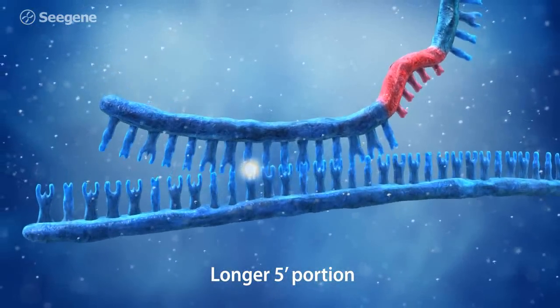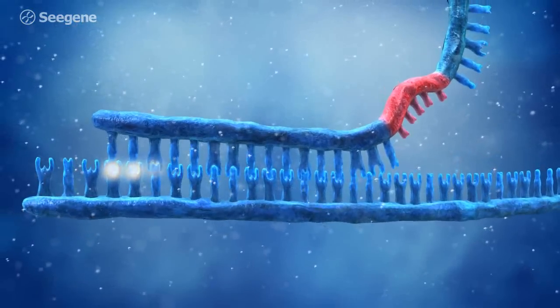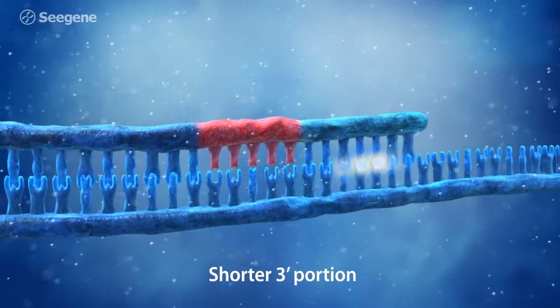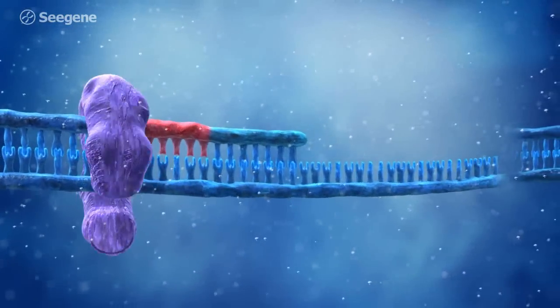In contrast, the 3' portion under normal PCR cycling conditions cannot bind to the template DNA by itself. The 3' portion works as a determiner of specificity. Its binding is required for elongation of the DPO primer.